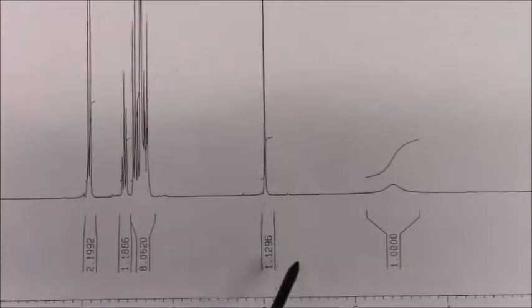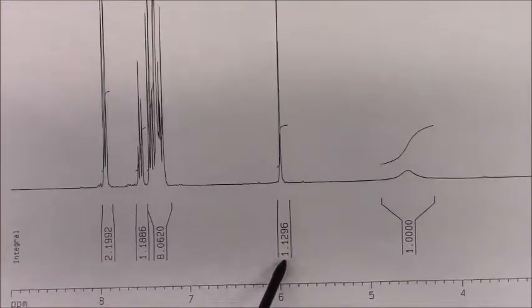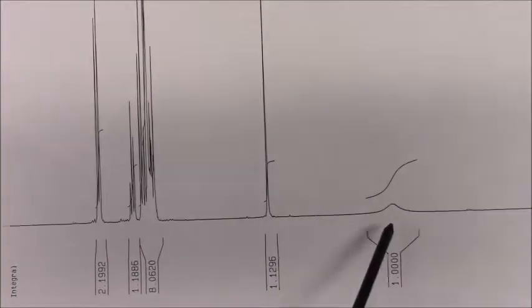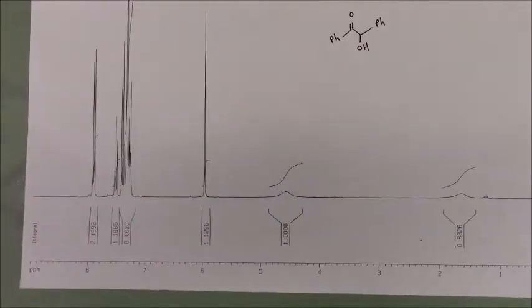As promised, the hydrogen D, which is a nice singlet right around 6. And then this one, see how they're not talking? This is not a doublet, and this integrates to 1. That one is the blob, that is that hydrogen. What else they had is a little bit of water on that day that they ran theirs.